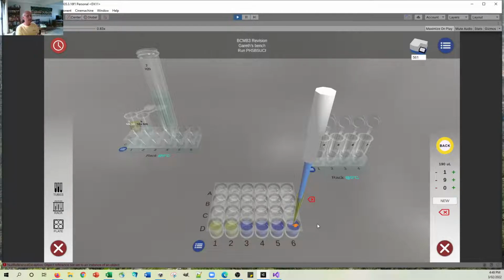Definitely the flip point is between 5 and 25 millimolar. I'm sure it's 20. In fact, I could probably work out how much tris to put in there to make that one 25. I just can't think of it on the fly.